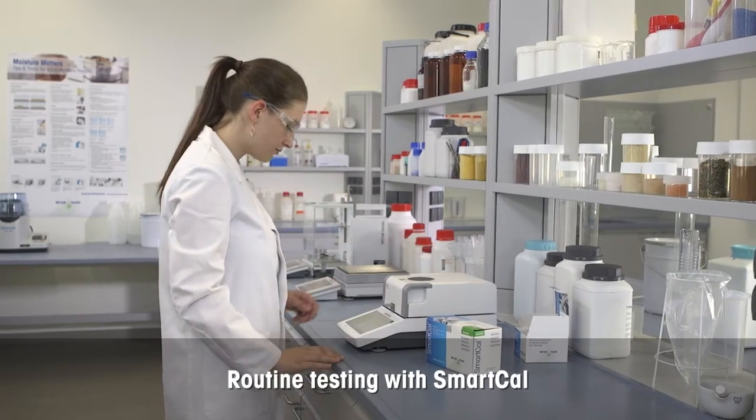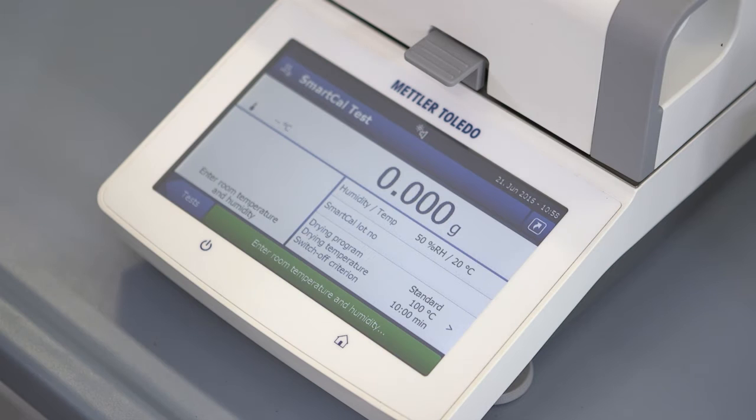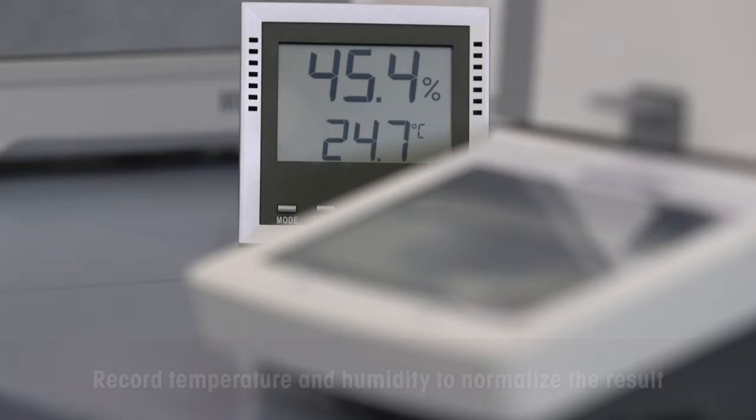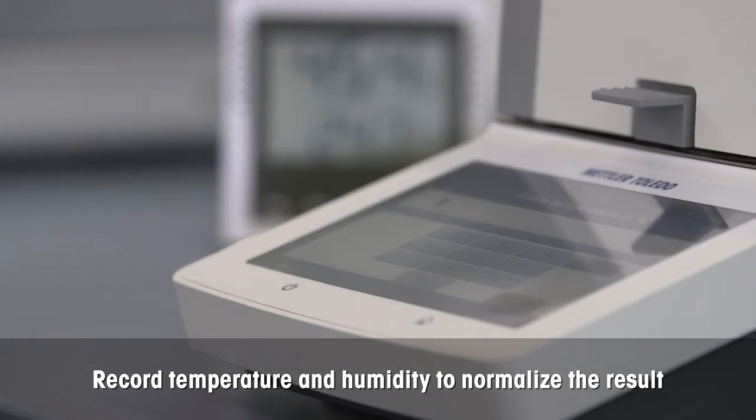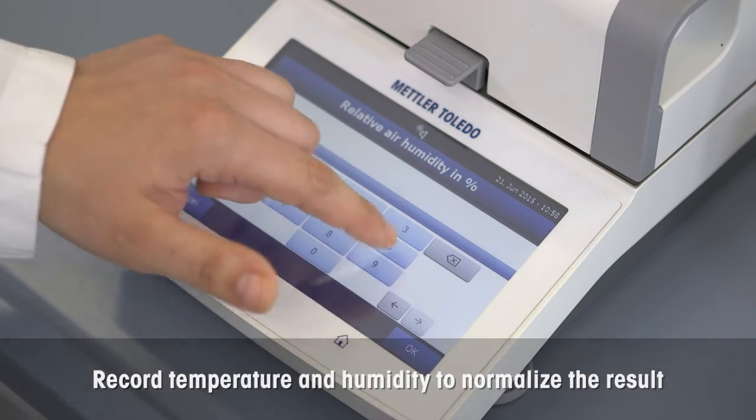To run the SmartCal test, select the integrated SmartCal method from the menu. Enter the room temperature and relative humidity directly into the device in order to automatically normalize the SmartCal result.